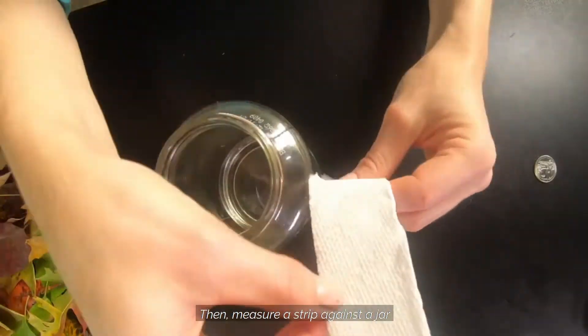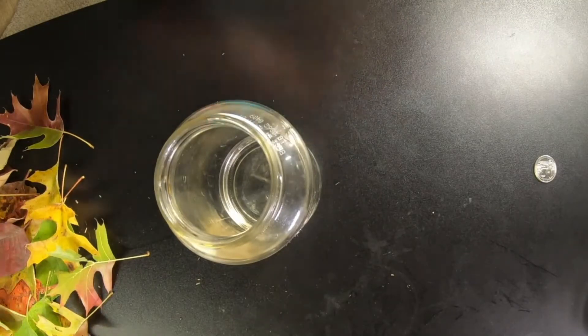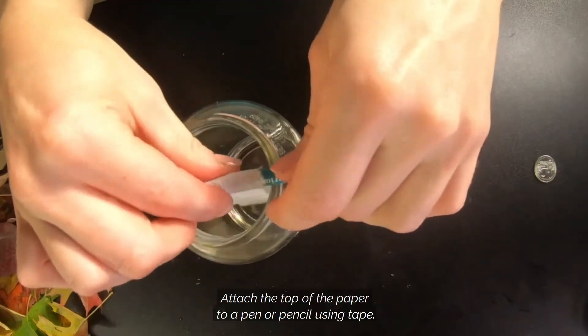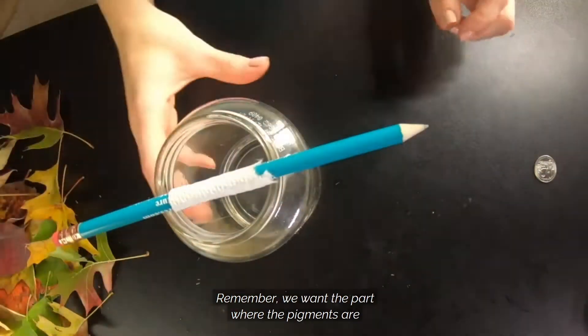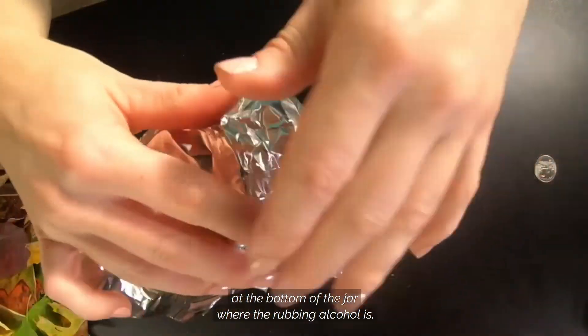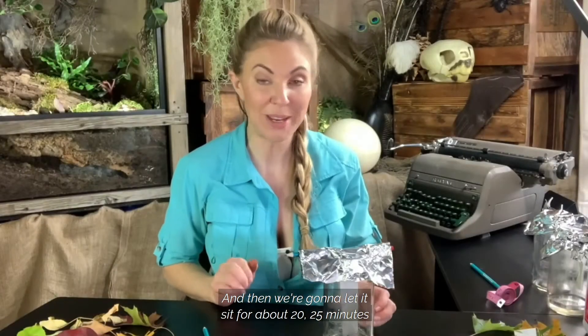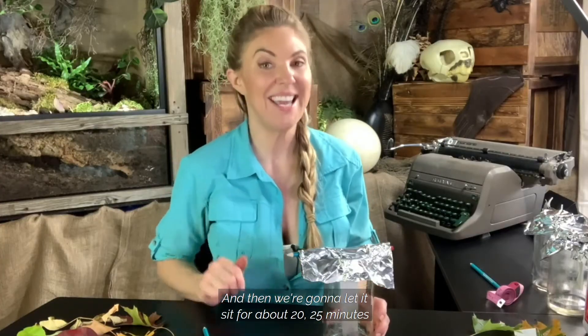Then measure your strip against the jar to make sure it's the right size. Attach the top of the paper to a pen or pencil using tape. Remember, we want the part where the pigments are at the bottom of the jar where the rubbing alcohol is. Finally, cover your jar again and repeat for the rest of your piles. Then let it sit for about 20-25 minutes and see what we find.